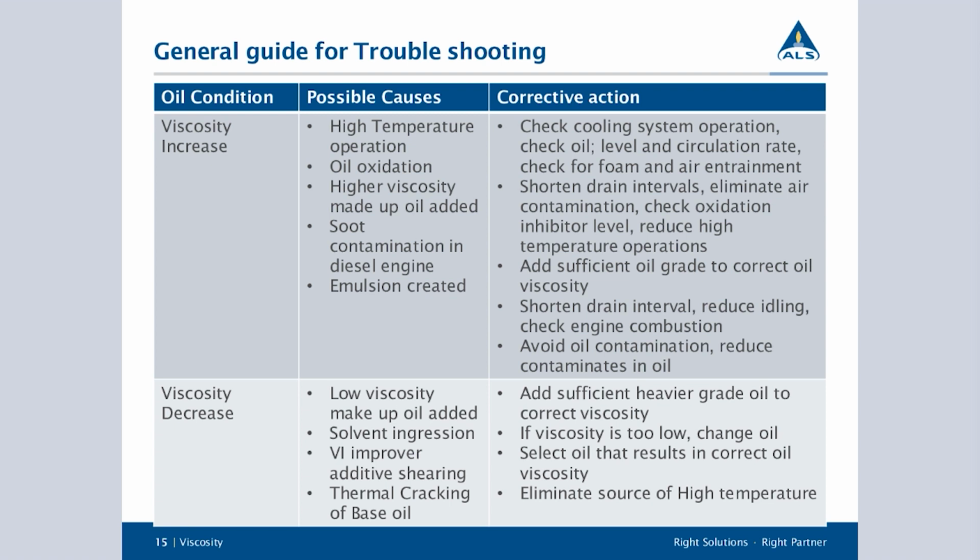So you want to select the correct oil. If you're running it and you're seeing a decrease, this may be because of shearing, meaning that at your higher temperatures, the chains of oil start to shear off. They look like carbon and hydrogen, like this. So you have a chain, and partway through this chain, it's just cutting it off.